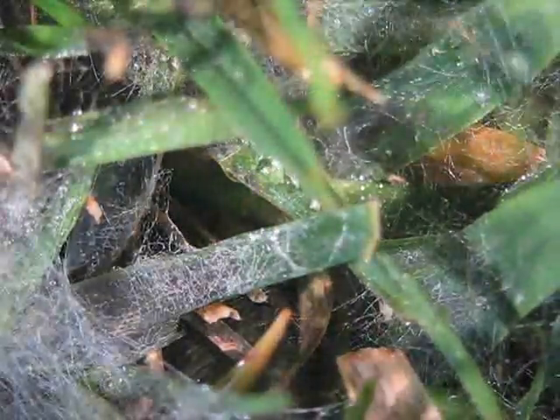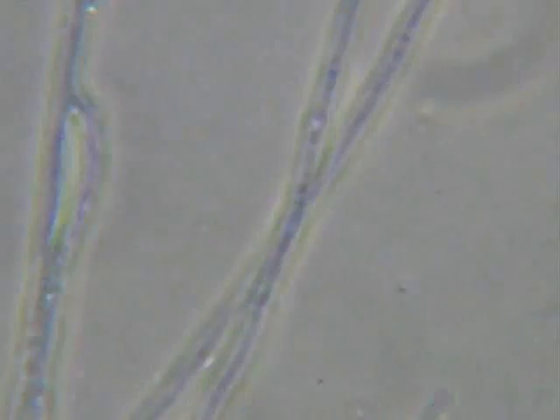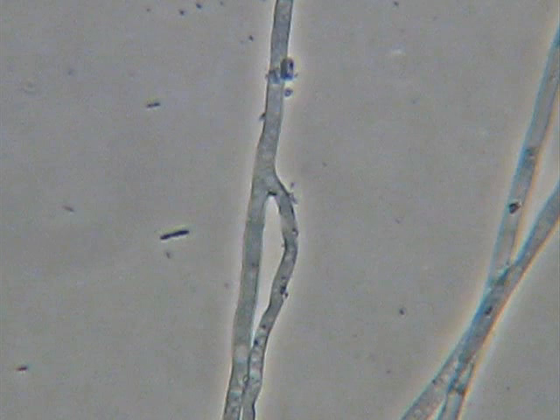We'll transfer this to a microscope slide and take it to the compound scope. What we see here is mycelium bending at an angle, which is very typical of a Pythium-type species. We also look at the hypha and see that there is no septa at all, and there's even some branching — also indicating no septa. So we're pretty much in the general arena of the oomycetes, which include the Pythium species, which is probably what we are looking at.